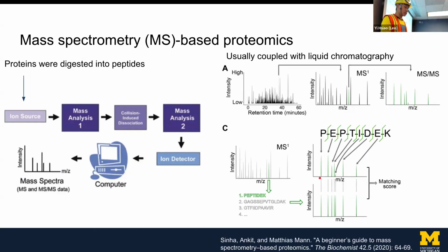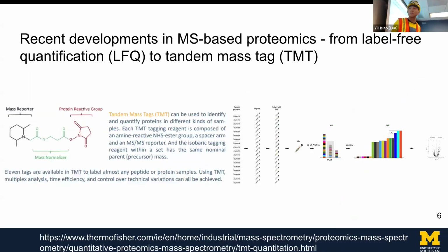Yeah, and in recent years there have been many breakthroughs in this area. I think if you started probably 20 years ago, you would know that proteomics data through mass spec had many missing values, but now, from either the instrument or the algorithm side, we are able to do quantification better.